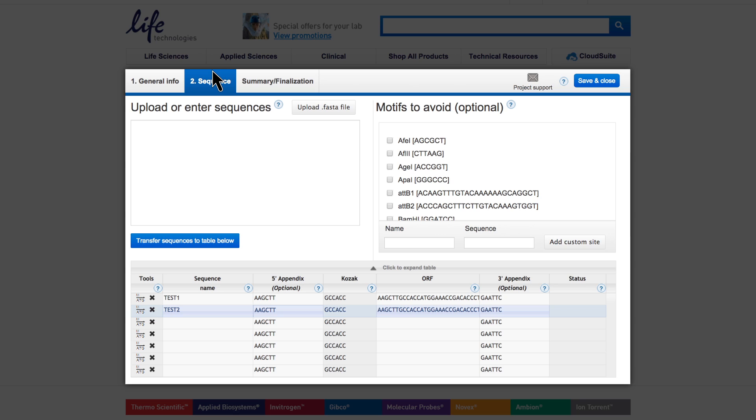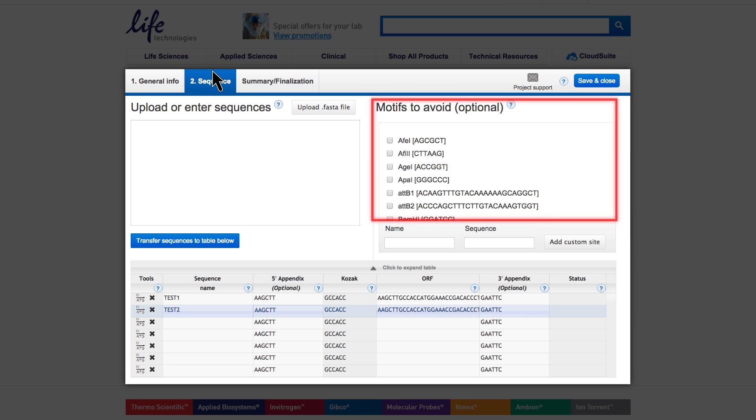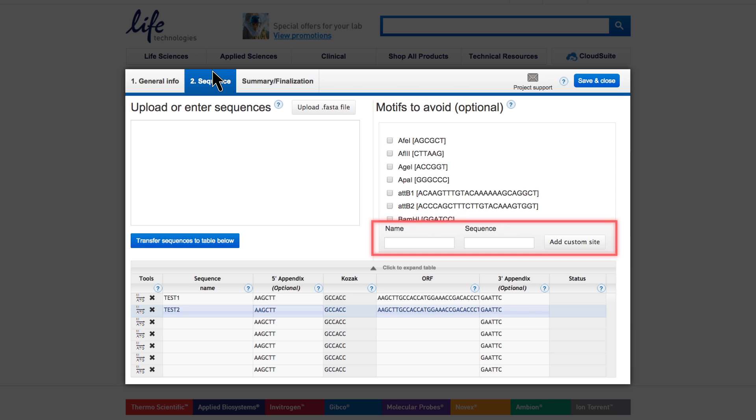When you add a sequence into the appendix field and confirm copying it to all the line items, don't mind that all empty line items get filled. Finally, if some cloning sites are not allowed to be generated by the optimization, you can select them in this list or add them individually.